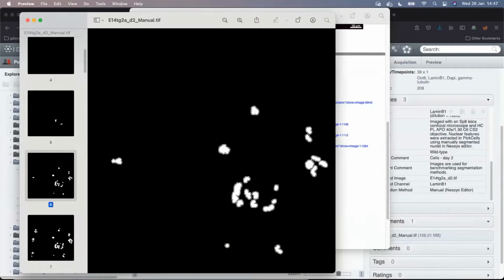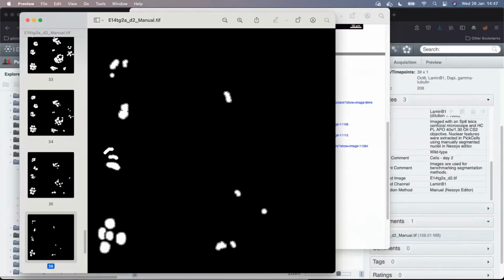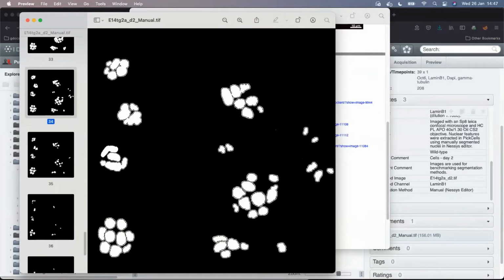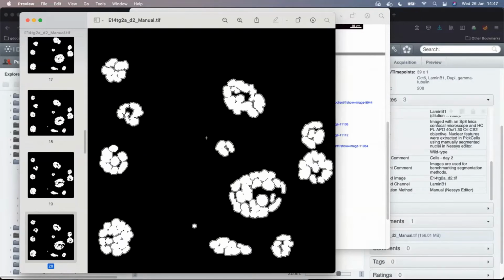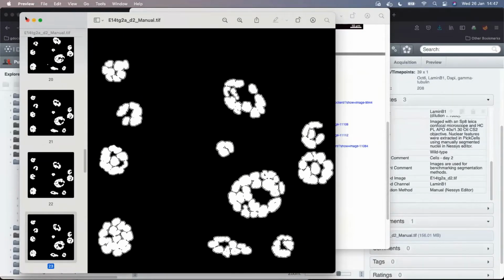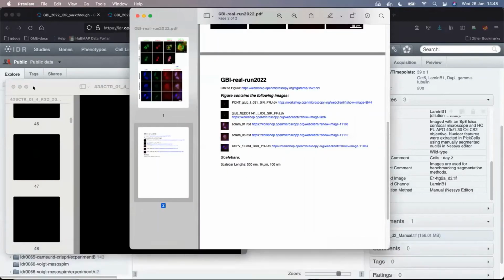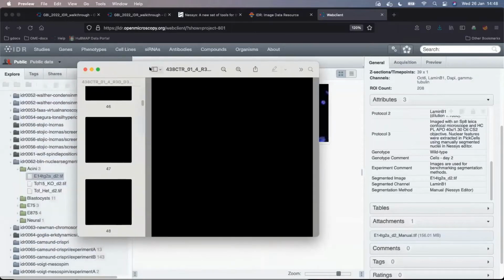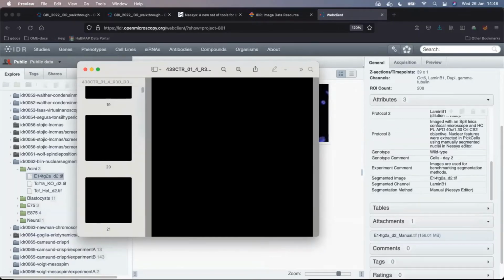And you can see that if I go into that, these are basically binarized images of the segmented nuclei, and you can basically say that they highlight the regions of interest from their image analysis, and thus not only was this image attached inside the database of IDR to the appropriate raw data image, but also the IDR team made the effort to turn the spots in the TIFF images into regions of interest in the Omero sense.